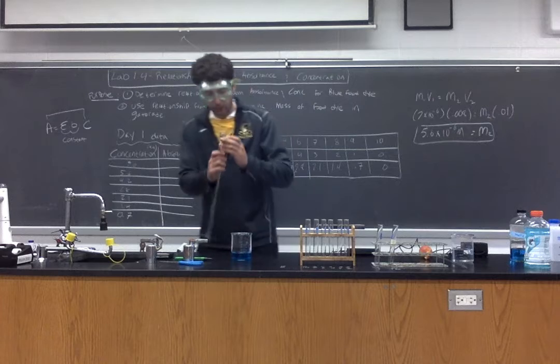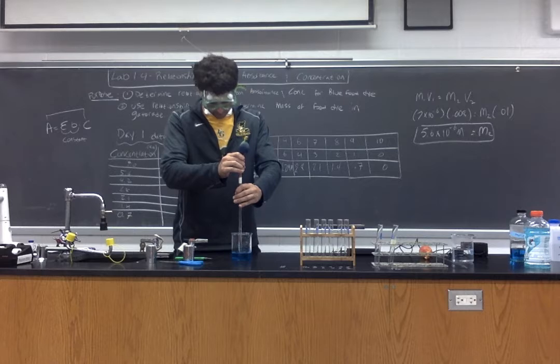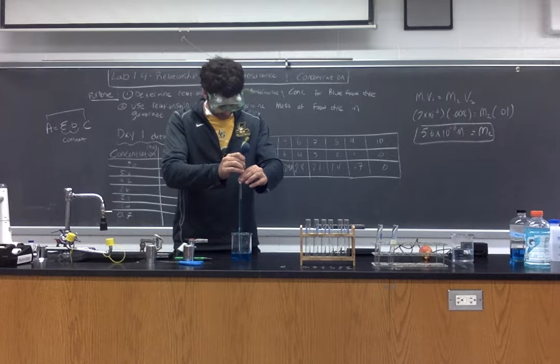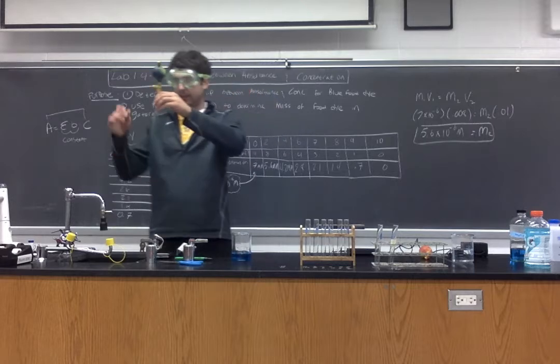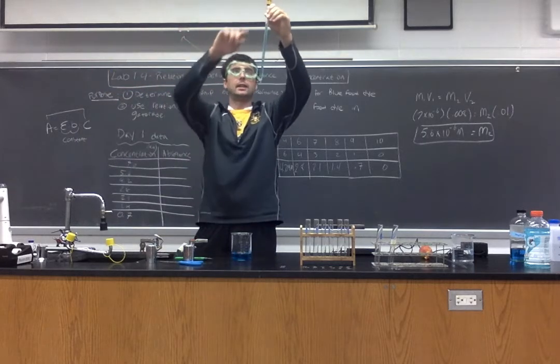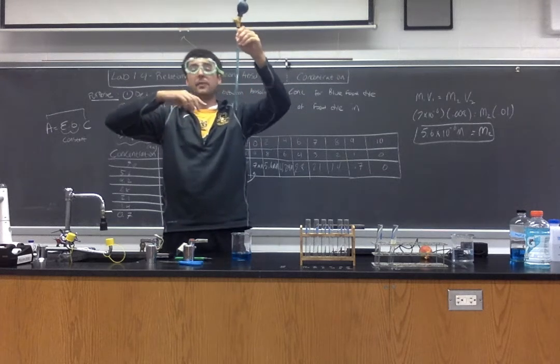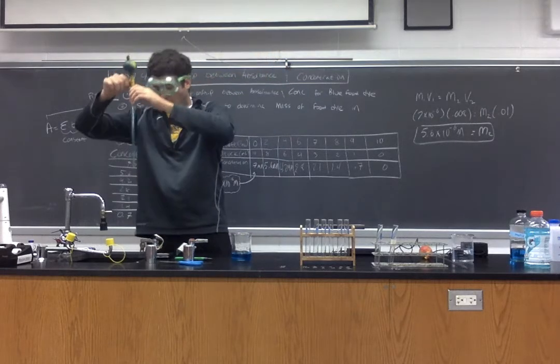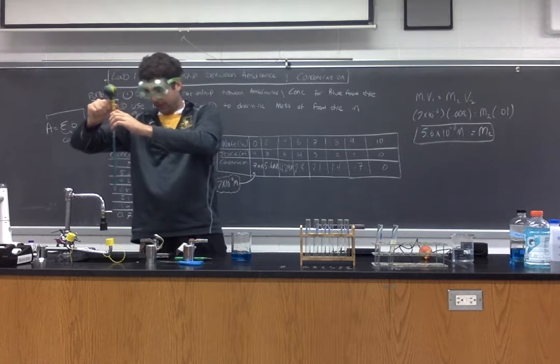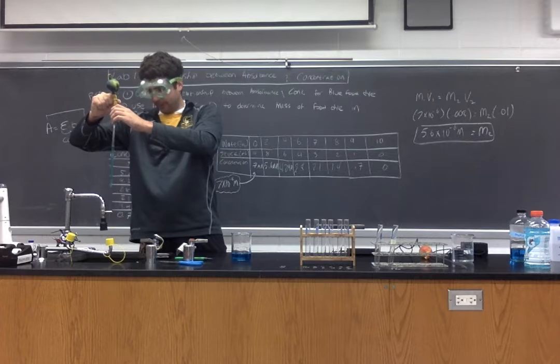concentration. So before I get started here, I want to coat the inside of my volumetric pipette with stock solution. So you can see, hopefully, the stock solution rising in the volumetric pipette. Now what I'm doing here is I'm just letting it sit. I'm actually going to empty this down the drain. What I'm trying to do is coat the inside of the volumetric pipette with stock solution to ensure that if there was any water in here or any sort of contaminant, I am rinsing it out, and all we are going to have is our stock solution. So, rinse this out. I'm going to do the same thing with my deionized water.